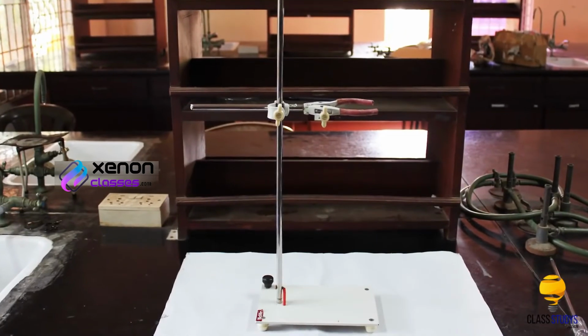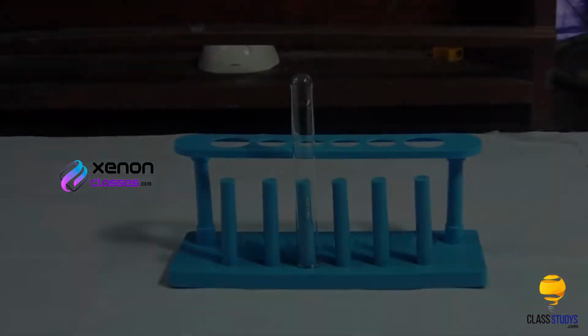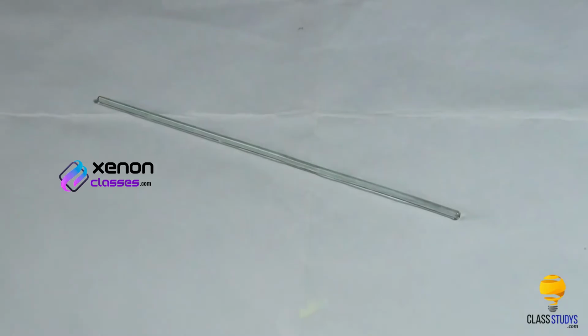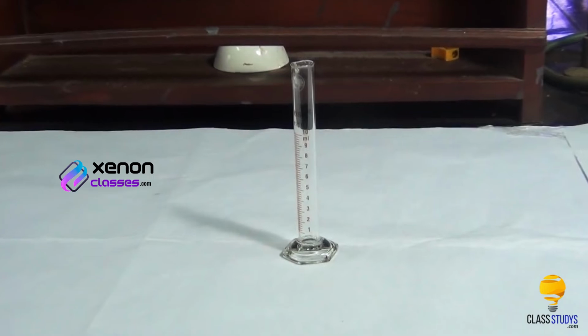burette, burette stand, 20 ml pipette, test tube, spatula, glass rod, dropper, measuring jar.